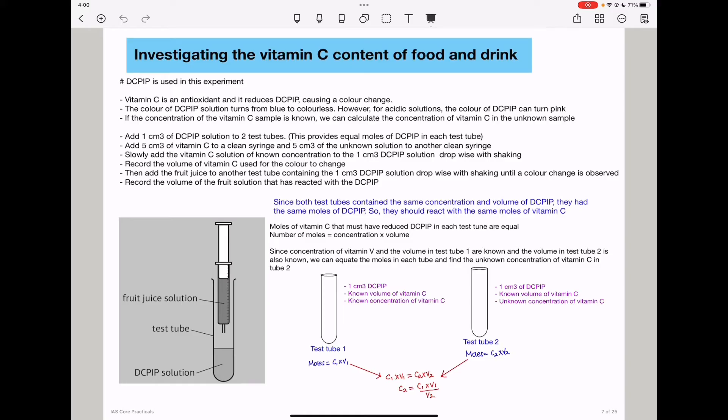And then we'll slowly carry out an experiment, as we can see here. You will use a syringe to release vitamin C solution whose concentration is known into the test tube containing 1 cm³ of DCPIP solution. And with every drop, you are going to check to see if there is decolorization of the DCPIP solution. So release drop-wise until the DCPIP solution is decolorized. And then note the volume of the vitamin C solution that has been released in order to decolorize the sample.